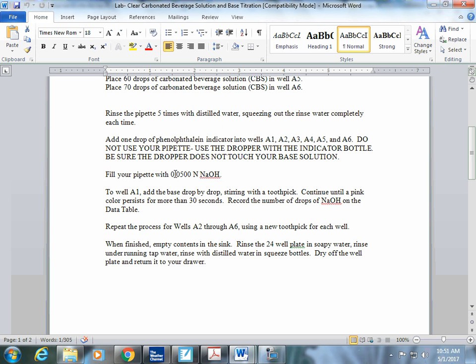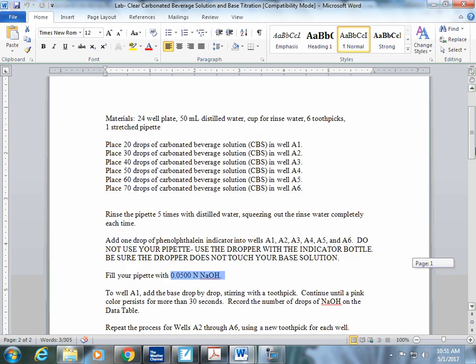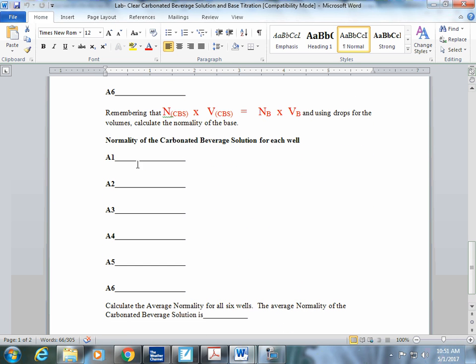Well, what's NB? What is the normality of the base? Well, we come back up here, right here. There is the normality of the base. What is the normality of the carbonated beverage solution? Well, that is our unknown. That is what we are trying to find. What is the volume of the carbonated beverage solution? Well, if I come right back up here, don't I have how many drops I've added? Absolutely. So we can do that calculation and we will get 6 different calculations of normality of the carbonated beverage solution. Now remember, the volume of the carbonated beverage solution changed in each well.